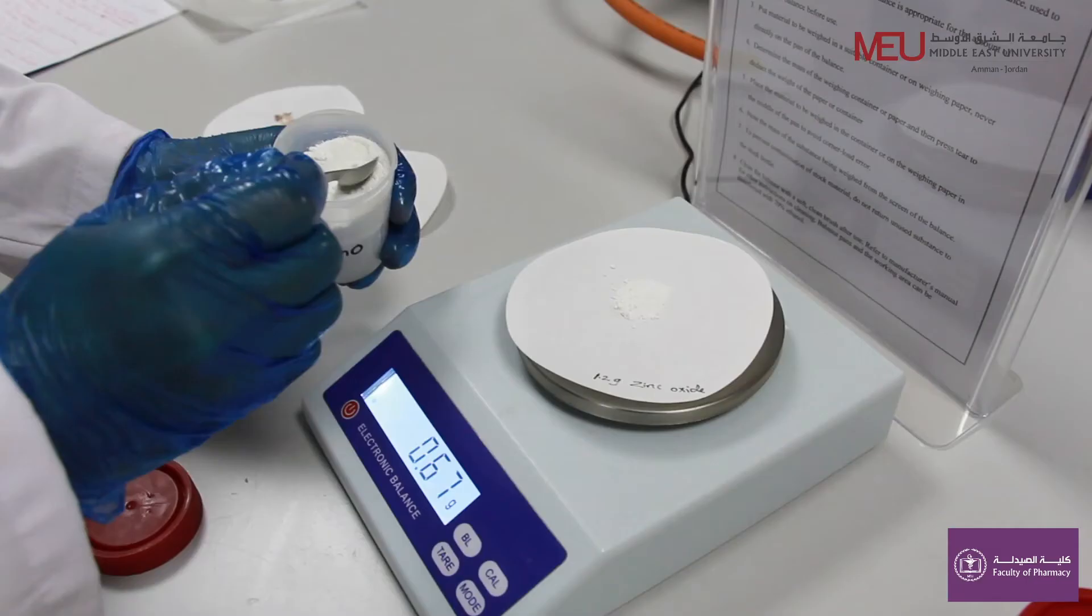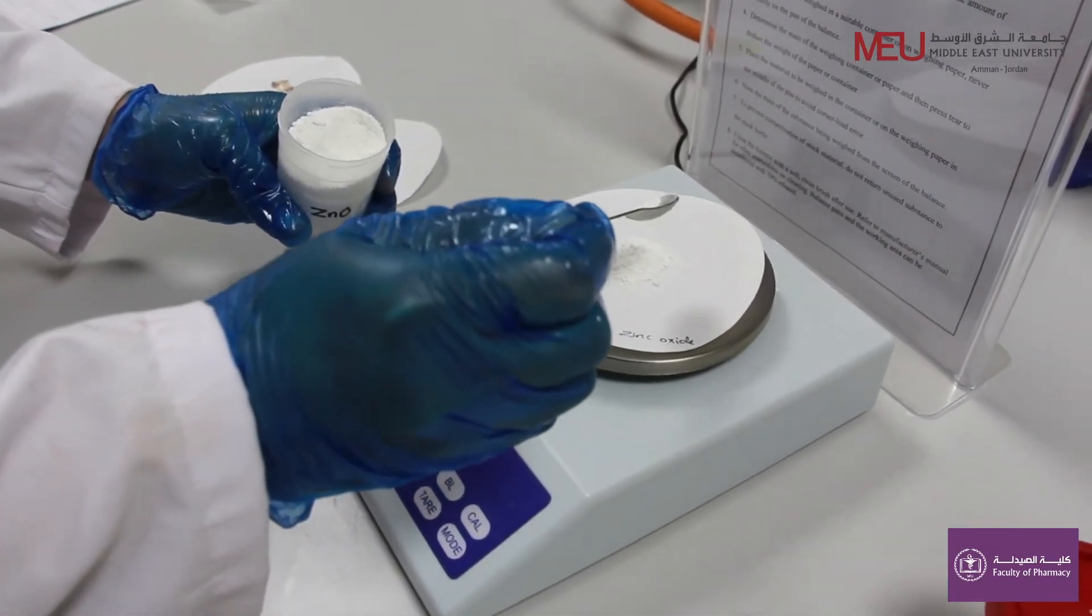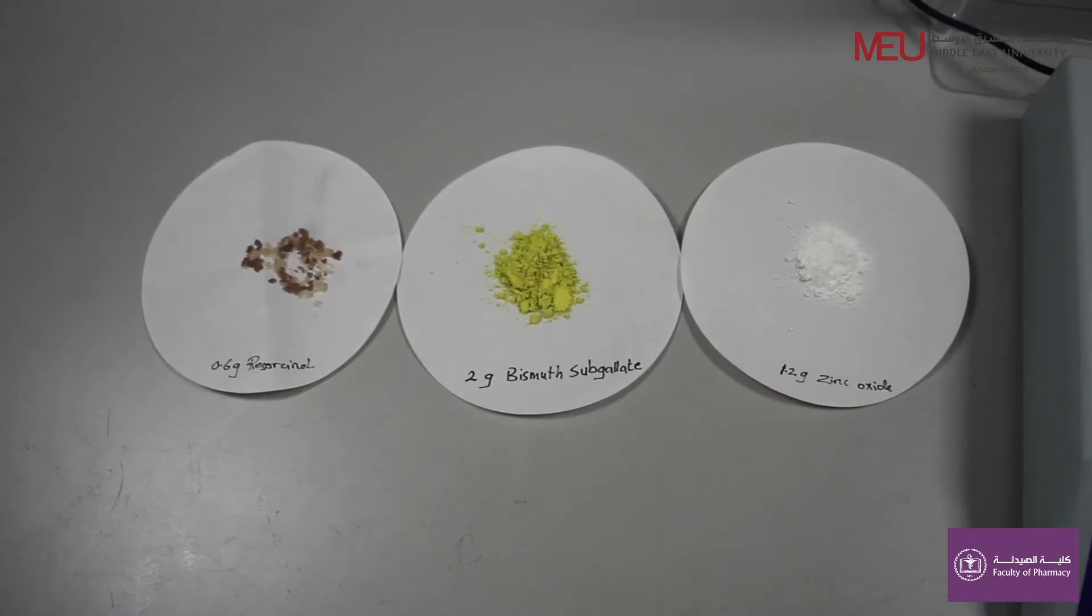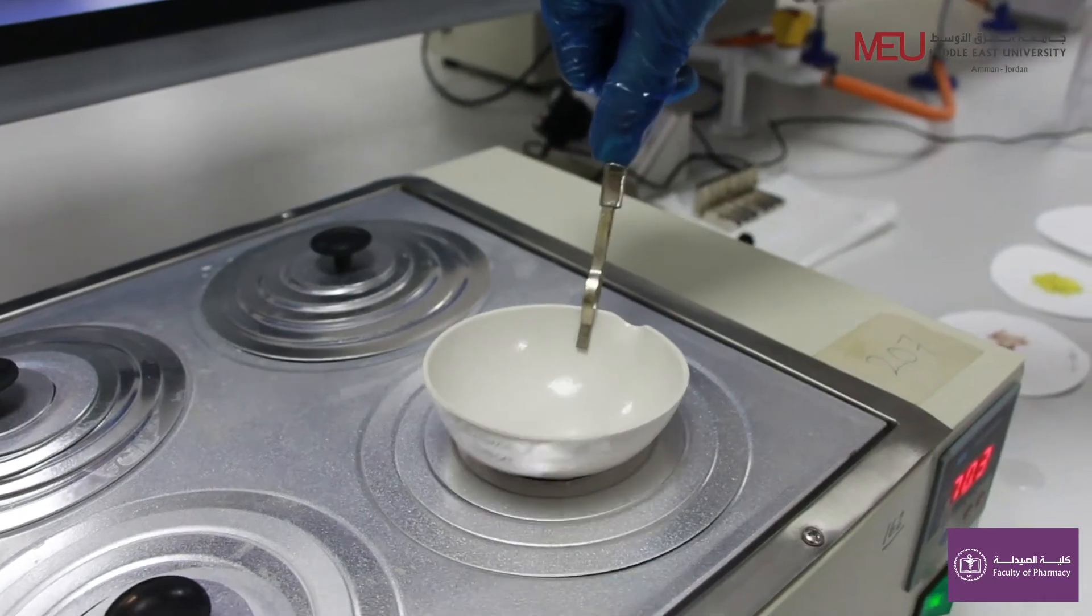Weigh 1.2 grams of zinc oxide which is used as anti-pruritic. Put powder in hot evaporating basin.